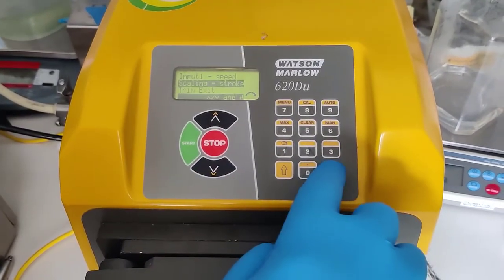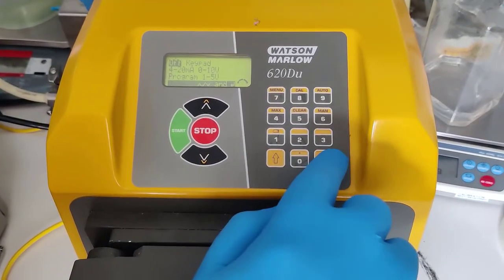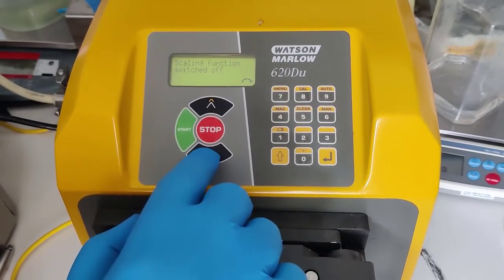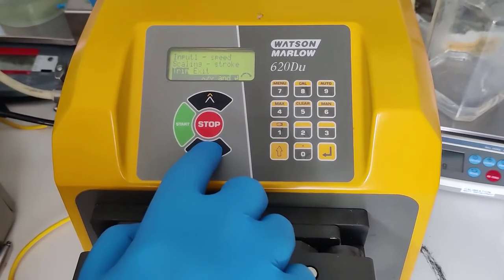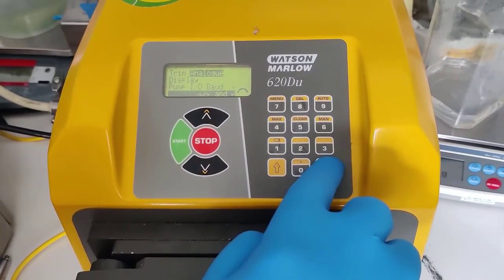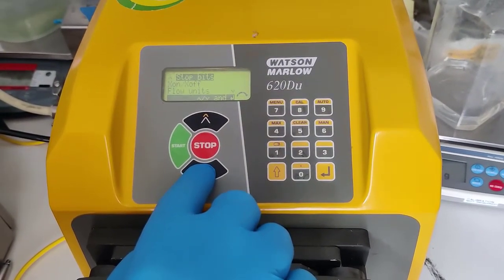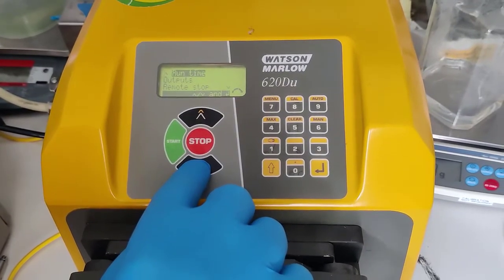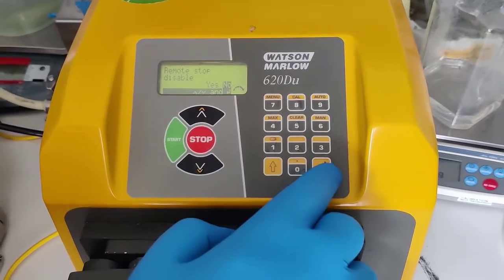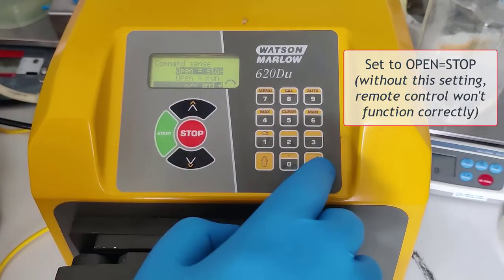Then go to scaling. This must be set to off for it to work properly. Go to exit and go through these choices which aren't applicable. Then under remote stop, press enter. Disable is no and open must equal stop for it to work properly.